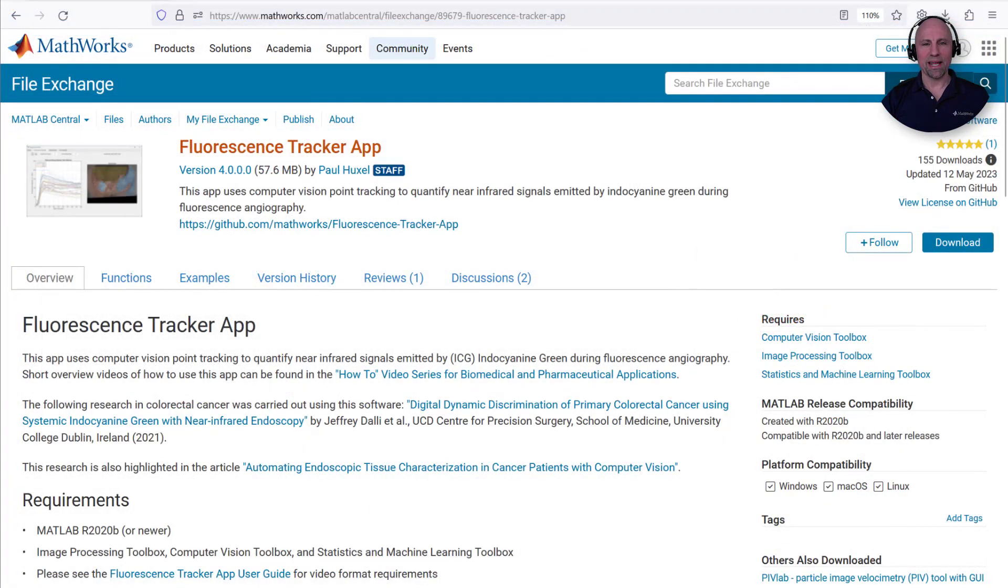This functionality has been added to the fluorescence tracker app we saw earlier. The fluorescence tracker app is available for download via the MathWorks file exchange or GitHub.